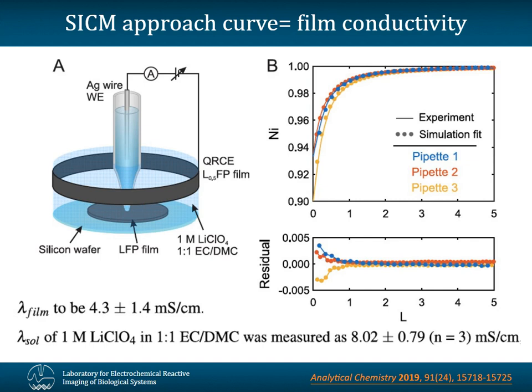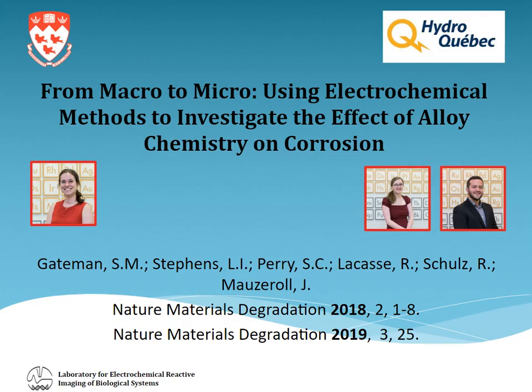So I'd say in recent years, more people have been trying to look at porous anodes and cathodes, whereas all the previous substrates that we had discussed were pretty solid. They had almost no porosity. All right, so now switching gears for my third story, it's to demonstrate how SECM can be used in the corrosion field.